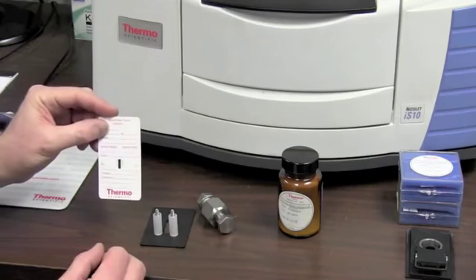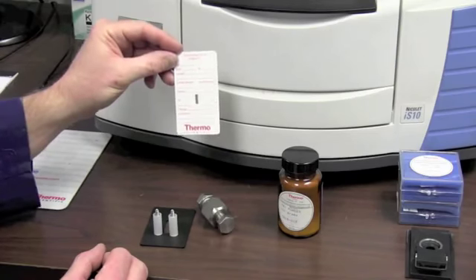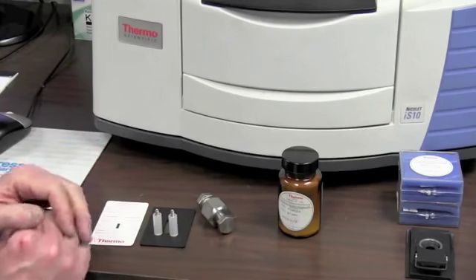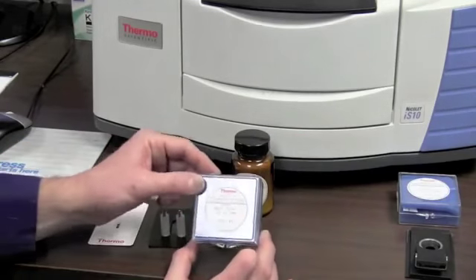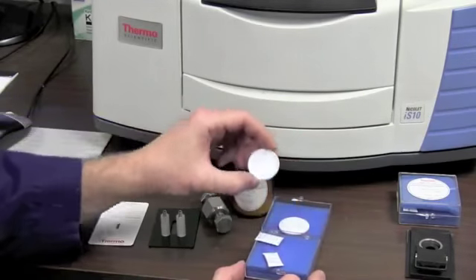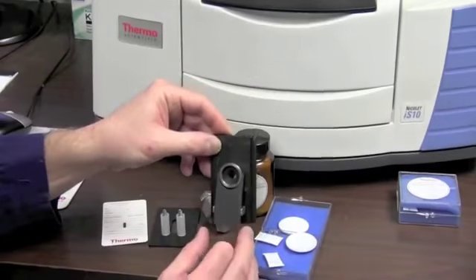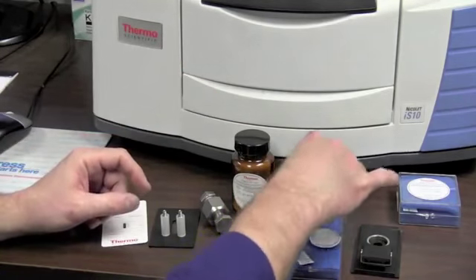Another way is with a thin film. If the sample is already thin, or it can be pressed into a thin film, we put it in this cassette, and then we put the cassette in the light path, and we read the analysis from that. We can also do Nujol, which is liquids. They're placed on sodium chloride plates. Put two of them together with the liquid between it and shine the light path through there. Put it in that holder, and we can measure that material in liquid form through the glass plates.